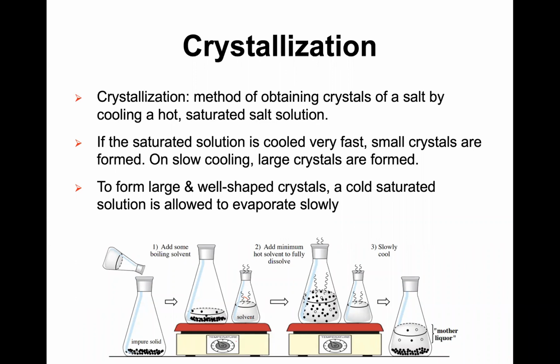After that, in this case, you continue heating, evaporate some of the solvent, and allow them to reach the saturated solution. Then you let them slowly cool down, must be slowly cool down. The reason for slowly cooling down is that way is to grow. So we will say grow crystals.